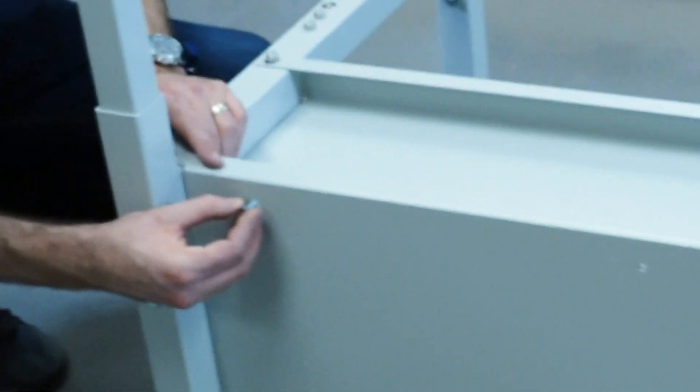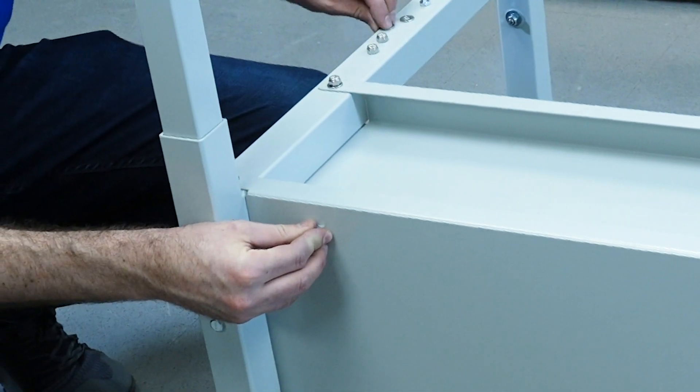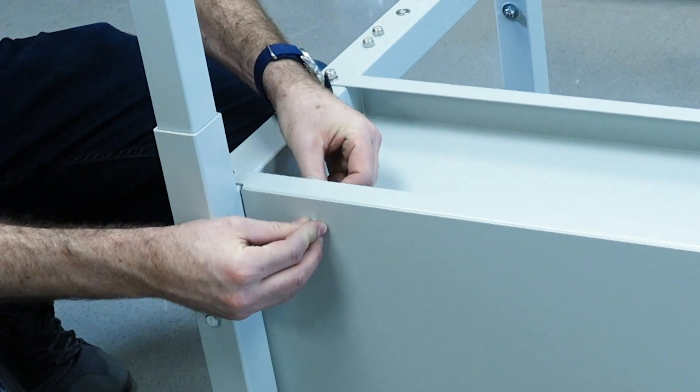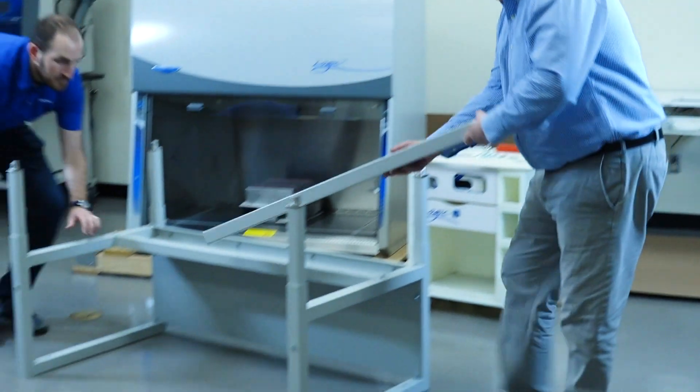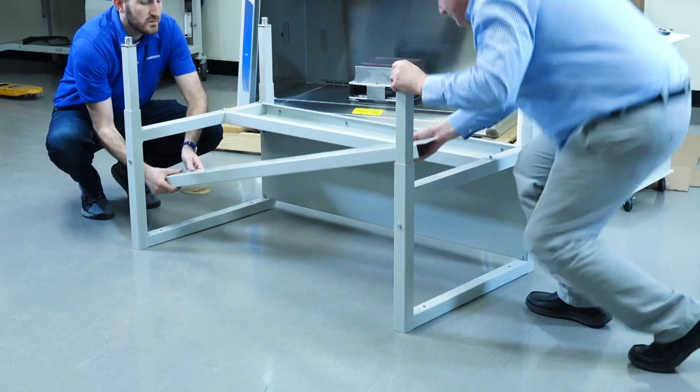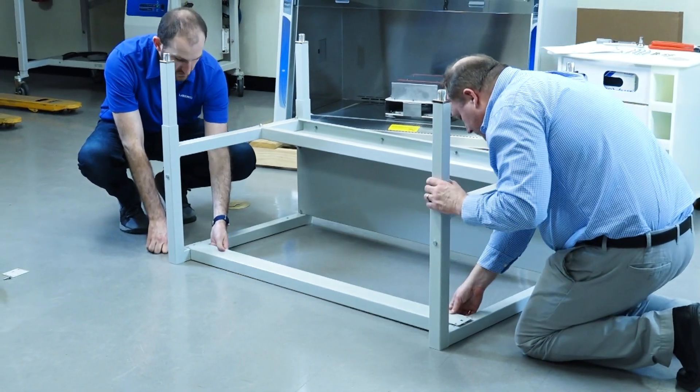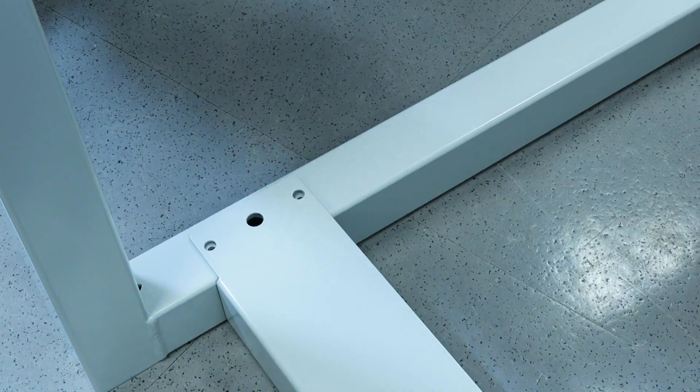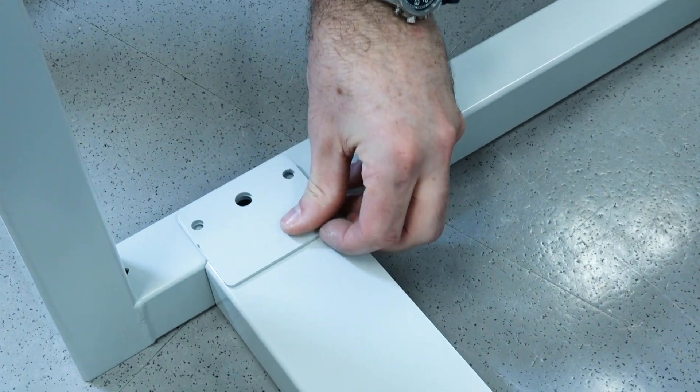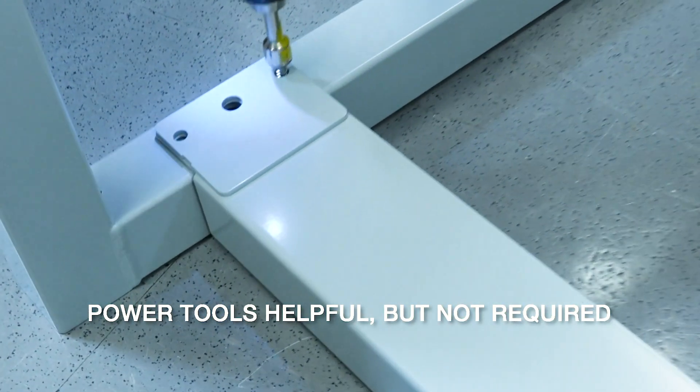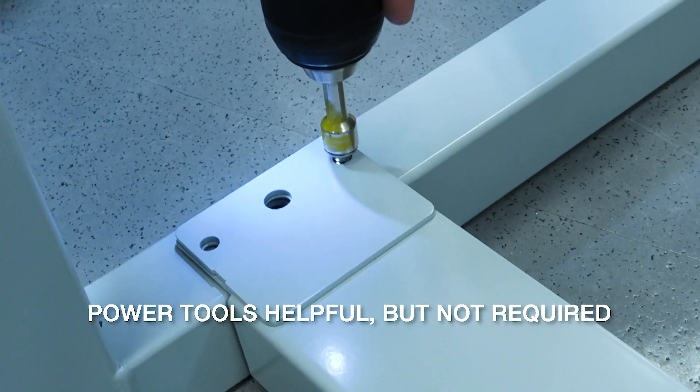Next, attach the top support plates to the underside of the assemblies using the four included self-tapping screws. Ensure that the screws are straight as you tighten the top support to the base stand. Complete the stand by tightening all the bolts before you turn it upright.